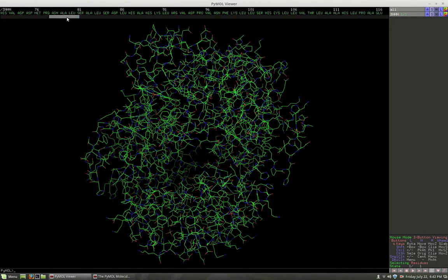and you can scroll through these and notice you have quite a few to look at here. Now SO4 is basically telling you this is the end of this particular protein. So we have more than one.